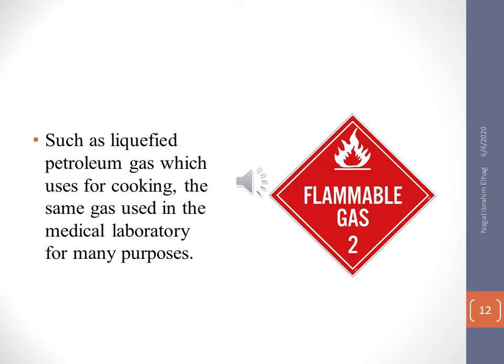Flammable gas such as liquefied petroleum gas, which we use for cooking, is the same gas we use in the lab. So we have to be careful about that flammable gas, because it is very explosive and it can cause a fire.